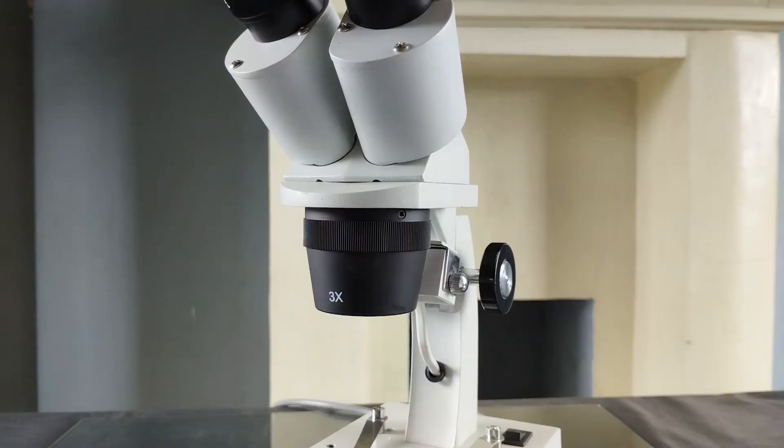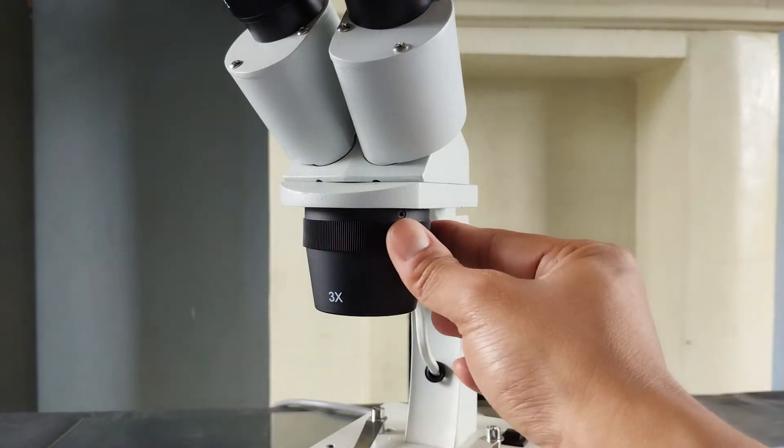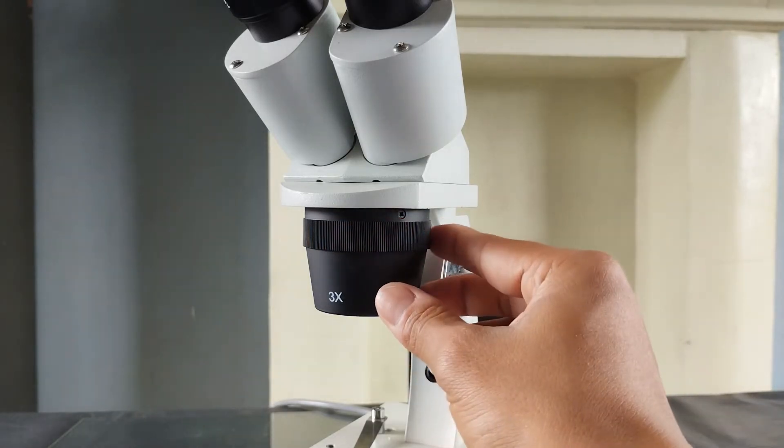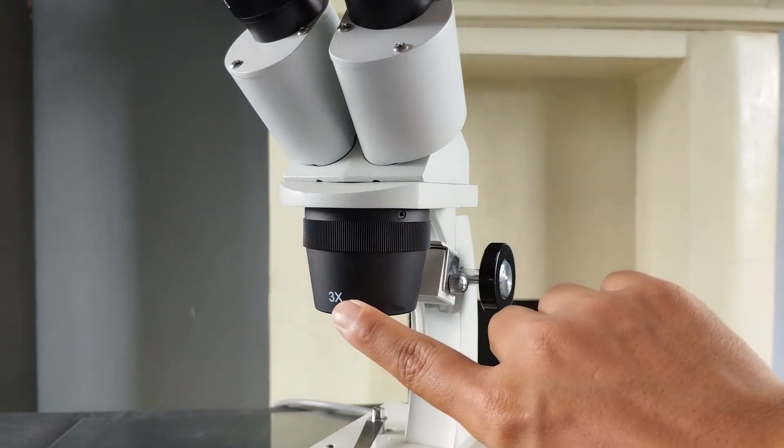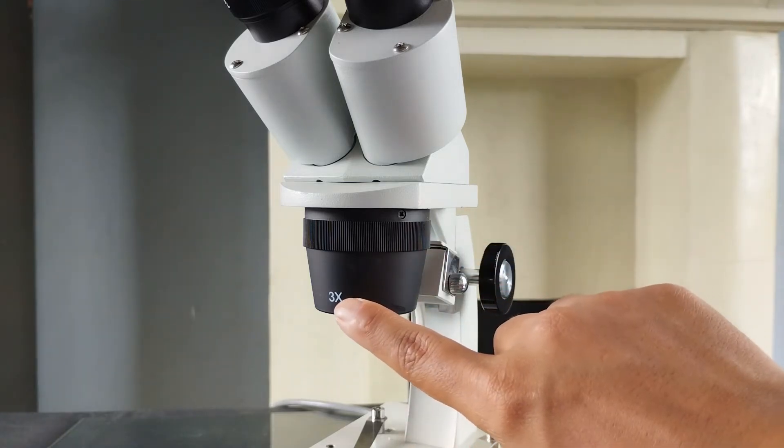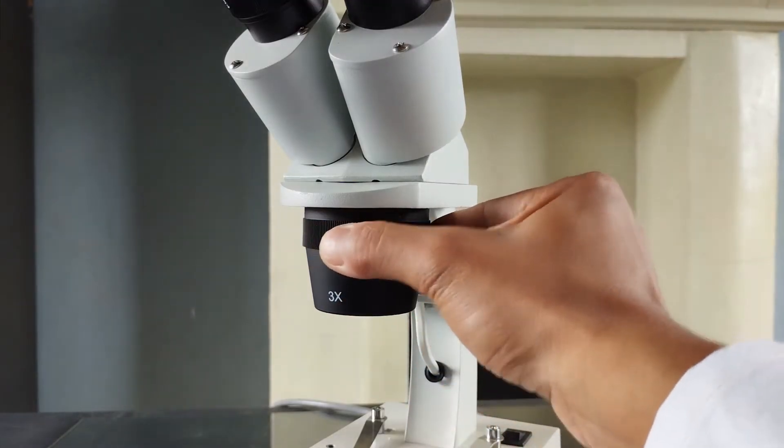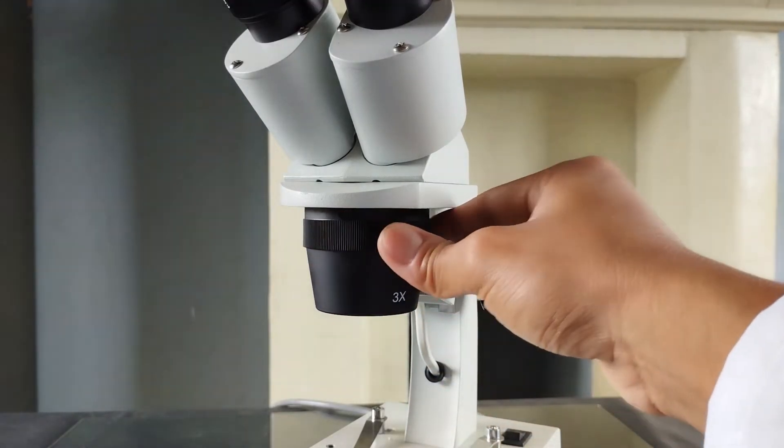Now, select the objective lens required for examining the specimen. In a stereo microscope, unlike in a compound light microscope, the objective lenses are collectively housed within a broad cylindrical tube that has the objective magnifications engraved on it. The tube is rotated until the required magnification clicks into position.